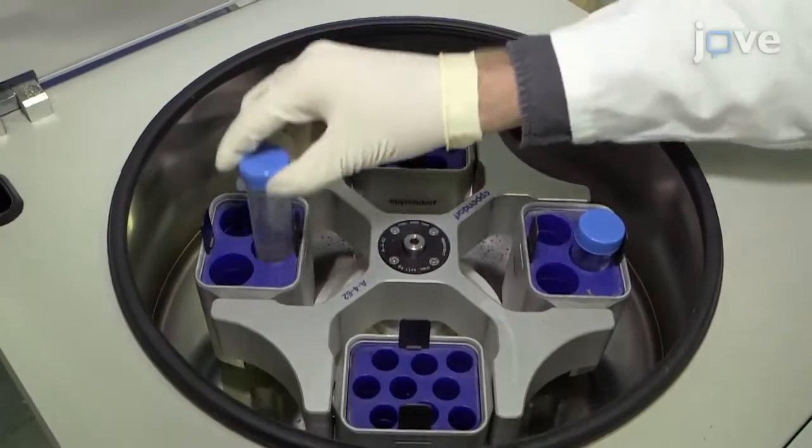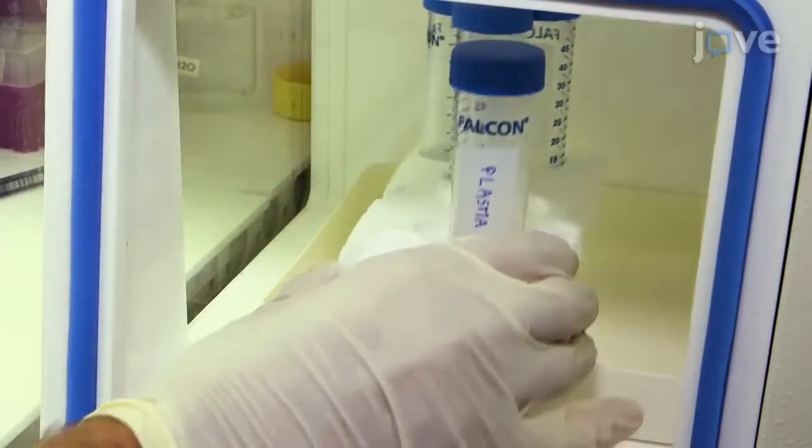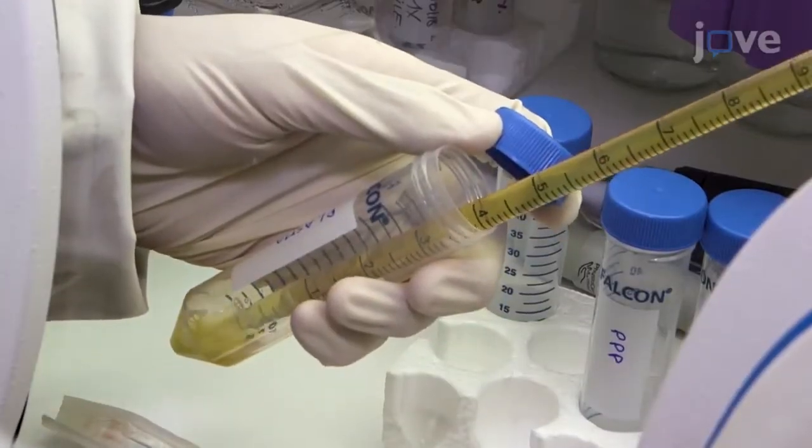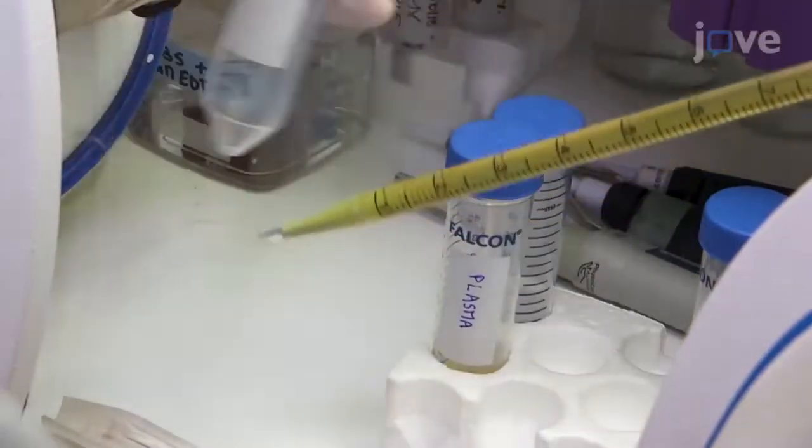After this, remove the tube of plasma from the anoxic cabinet and centrifuge it at 2,900 g for 20 minutes. Taking care not to disrupt the pelleted platelets, transfer the tube to the anoxic cabinet and pipette the platelet-poor plasma into a fresh 50 mL tube.